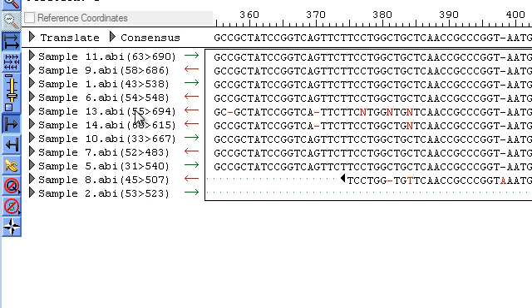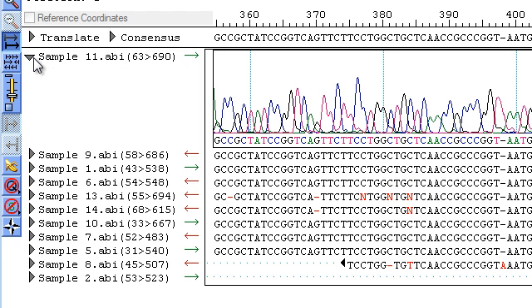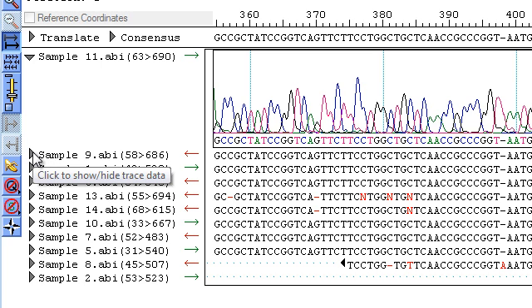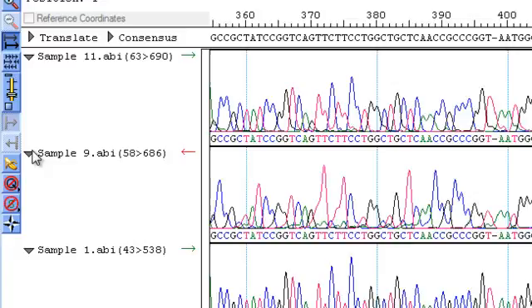To see the original trace data for the reads, click the arrow to the left of the sample name. As a shortcut, you can hold down the Alt or Option key while clicking down the arrow to show trace data for all of the reads.